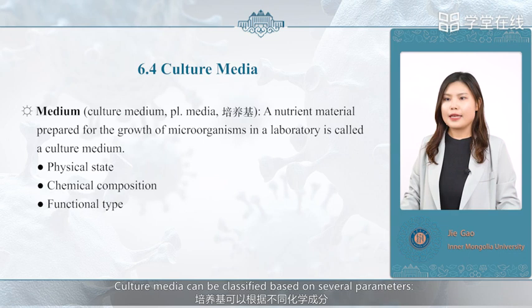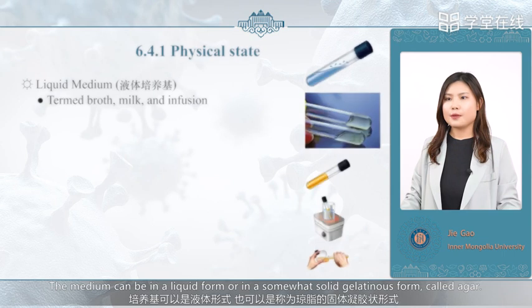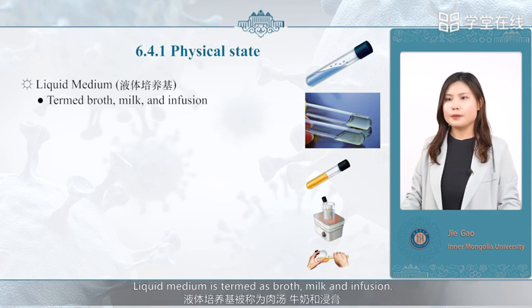Culture media can be classified based on several parameters: the chemical constituents from which they are made, their physical nature, and their function. The medium can be in a liquid form or in a somewhat solid gelatinous form, called agar. Liquid medium is termed as broth, milk, and infusion.